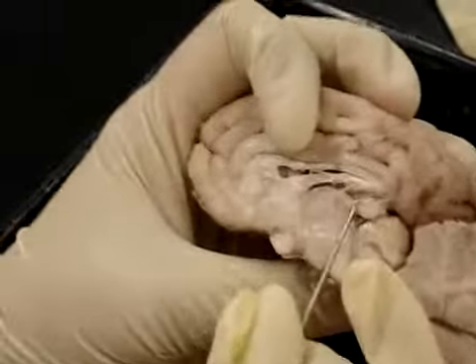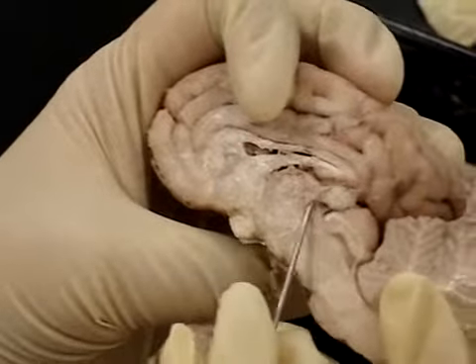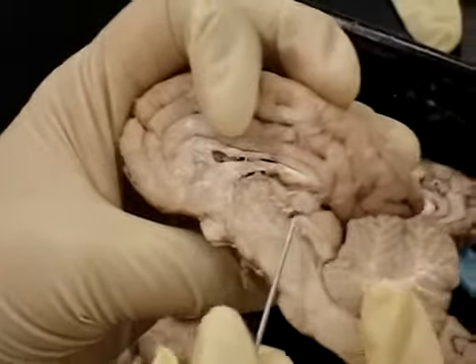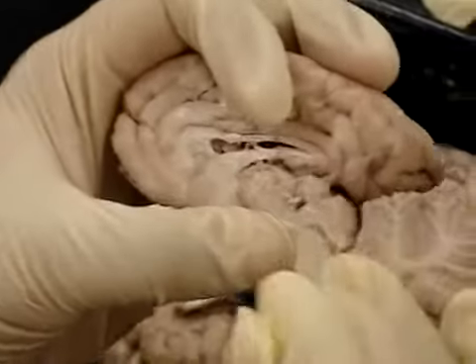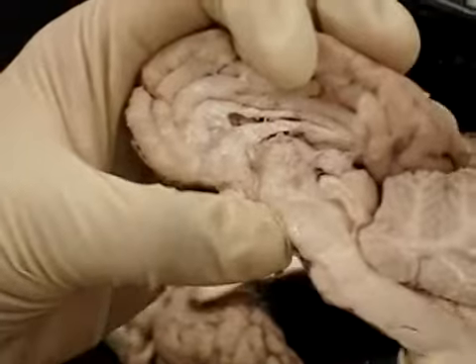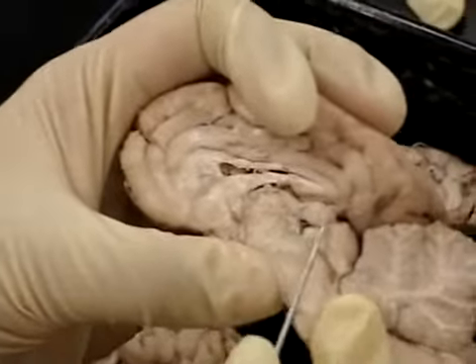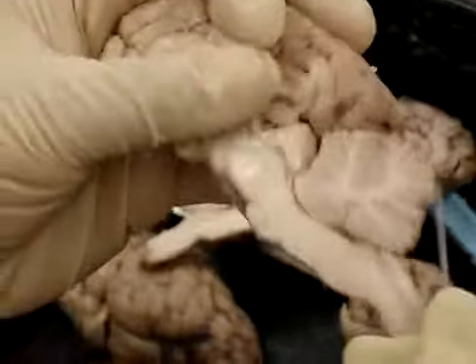The pineal gland is this, so there's the massa intermedia. Again, look for the massa intermedia. Behind that, this little oblong shape is the pineal gland. And somebody said that if you need a marker for it, it looks like a P. And can you point it one more time? This area, this round. Okay.